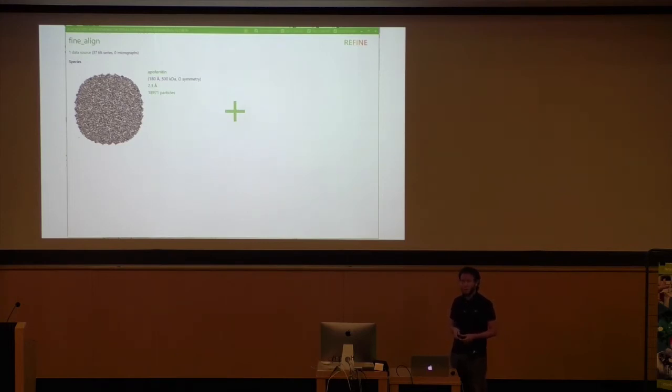The 1.0.6 release of Warp included the first public, probably not even alpha version of M. It had quite a few bugs, but if you want to go back to 1.0.6 and try it, it's already usable. I took it out in 1.0.7 because we want to publish some preprints about it soon.